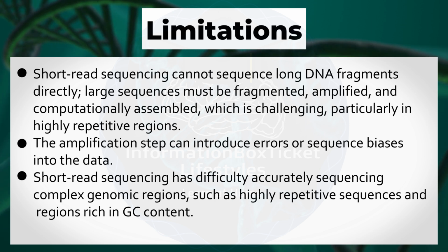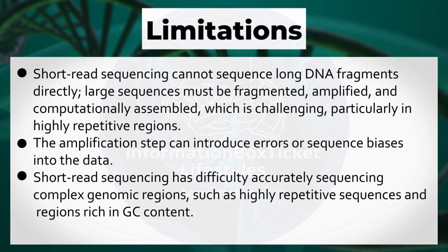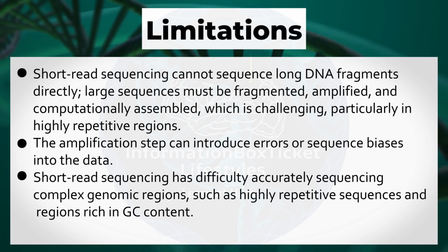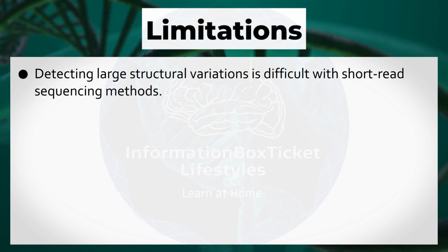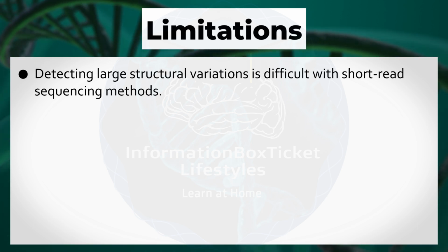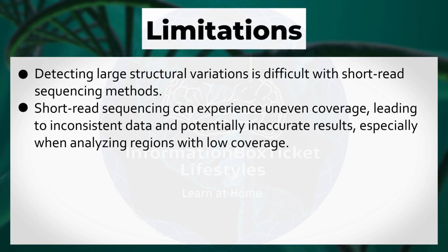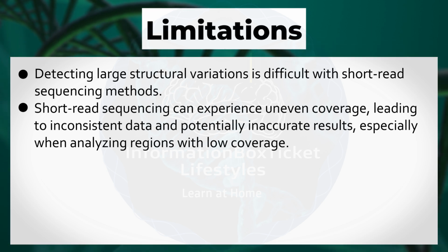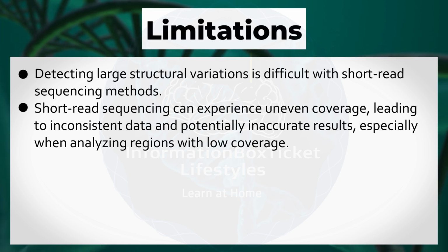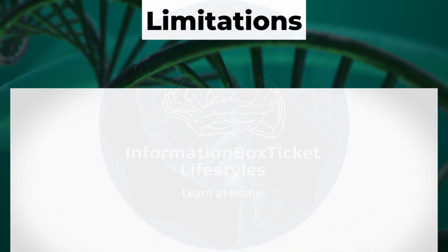Short-read sequencing has difficulty accurately sequencing complex genomic regions, such as highly repetitive sequences and regions rich in GC content. Detecting large structural variations is difficult with short-read sequencing methods. Short-read sequencing can experience uneven coverage, leading to inconsistent data and potentially inaccurate results, especially when analyzing regions with low coverage.